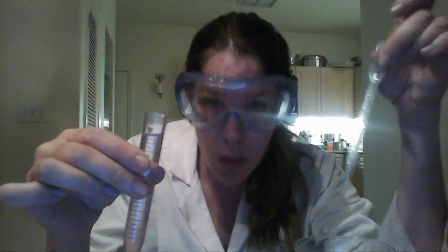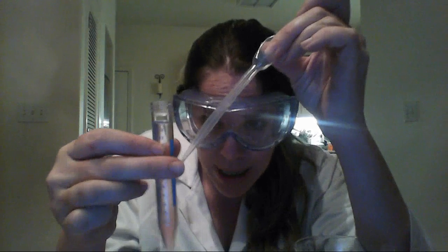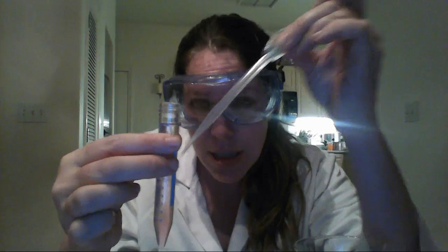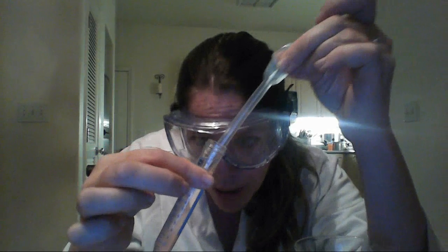You're going to want to squeeze it, stick it in as close to the DNA as you can, and then try to pull up just the DNA. It's okay if you get a little bit of the liquid, but try to pull up just the DNA, and we're going to stick that into the tube. So let me see if I can get my DNA. There it is. And it's kind of self-sticking, so it'll start sticking to itself.